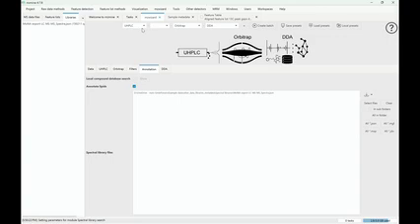So in the NIST we have two kinds, the match and the reverse match. And your tool is going with the match. So if the match is above 700, if we go with 70%, it will match the compound, but it's not the actual compound. So you have to either convert, or I think I have to make some settings in my library. I don't know. It should be with the reverse match, so it will give good annotation. So I think you can help me with that.